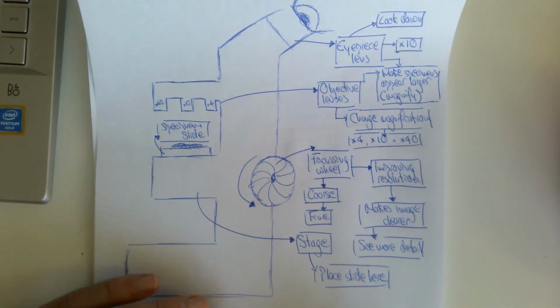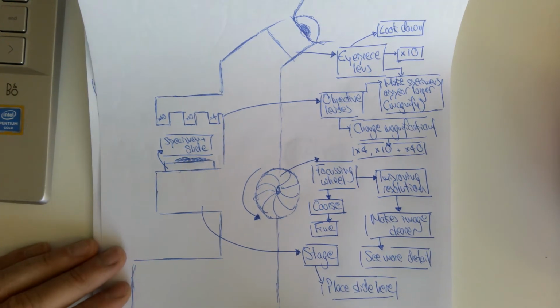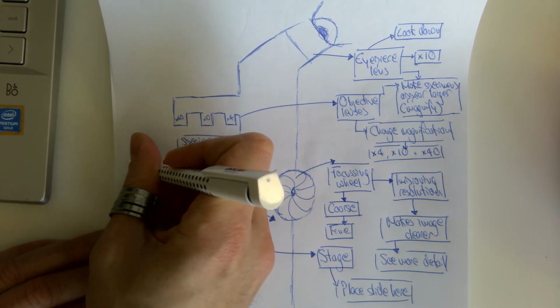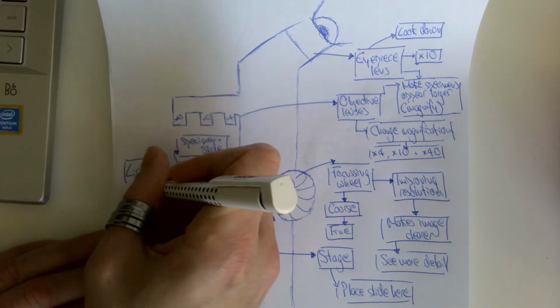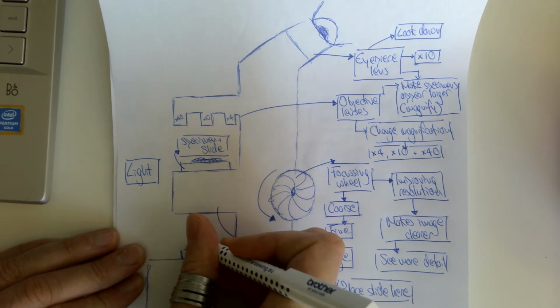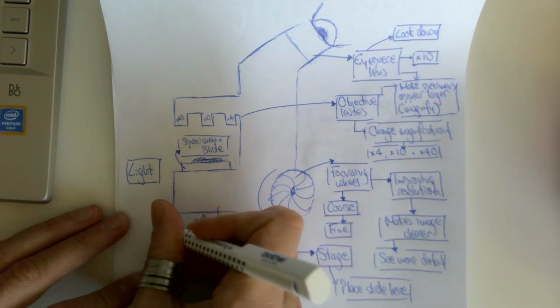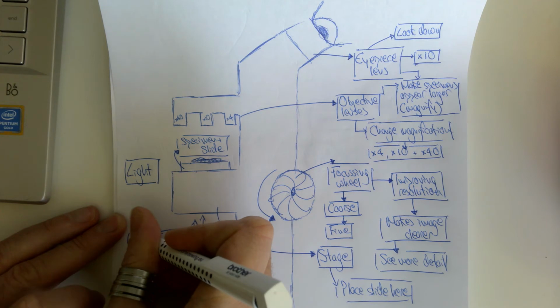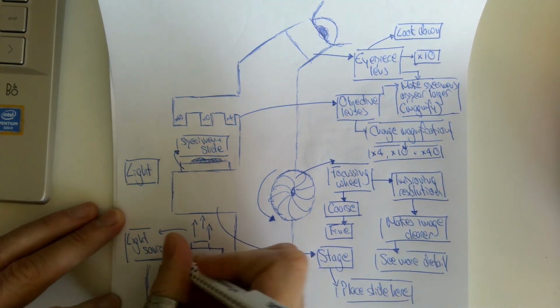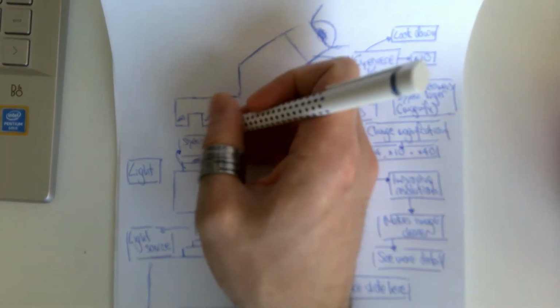Now, the other thing to remember is that when we're talking about these kinds of microscopes, the microscopes you use in school, they're often referred to as light microscopes because the image is generated by using a light source. And that light source shines through the stage, through a hole in the stage, through the specimen, into the objective lens to create the image.